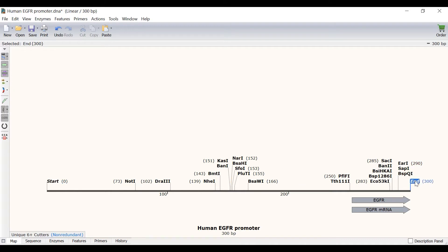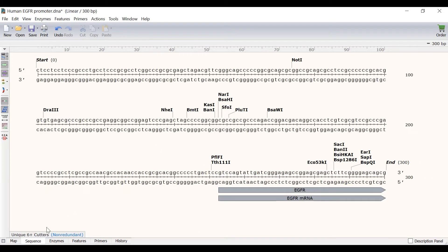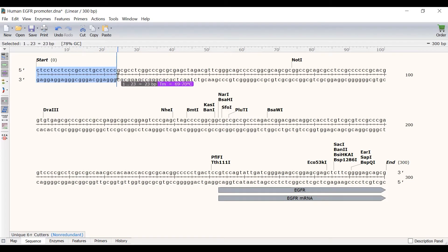Let's create the forward primer. To do this I will switch to the sequence view and click and drag on the sequence that I want to be the primer. I want the primer to have a melting temperature of approximately 60 degrees Celsius. As I click and drag to make the selection, SnapGene provides real time updates on the melting temperature. In this case the first 17 bases will give me a melting temperature of 60 degrees Celsius.